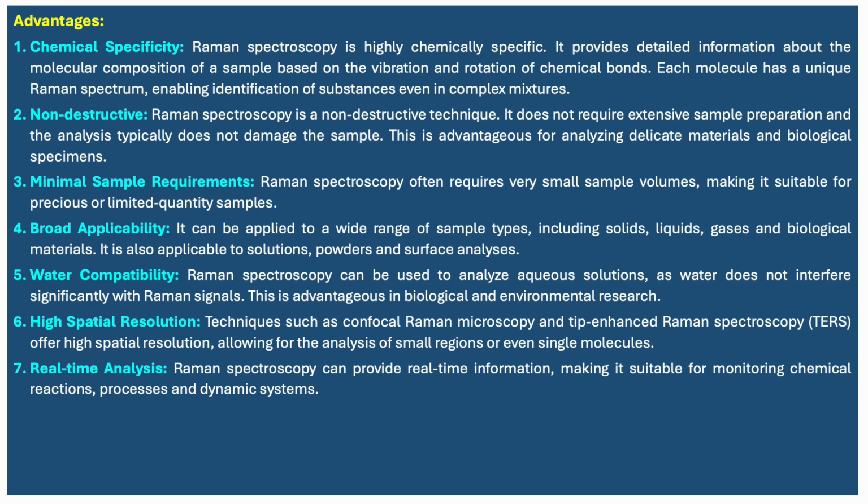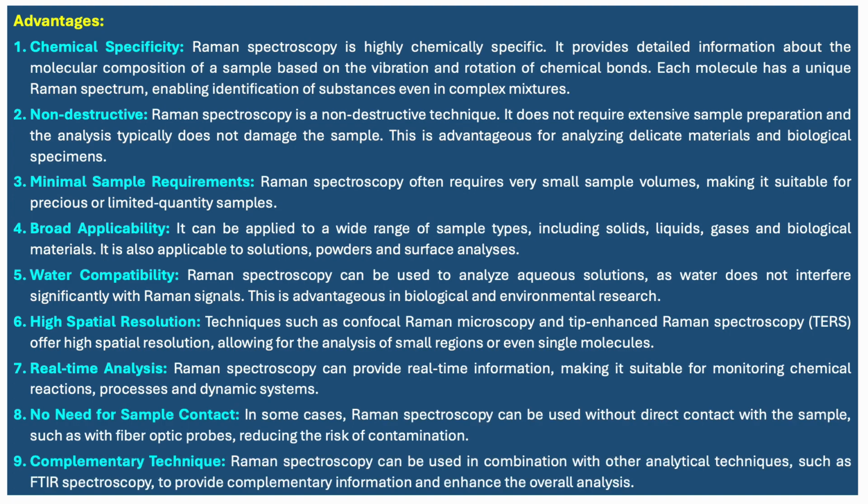Techniques such as confocal Raman spectroscopy and tip enhanced Raman spectroscopy offer high spatial resolution, allowing for the analysis of small regions or even single molecules. Raman spectroscopy can provide real-time information, making it suitable for monitoring chemical reactions, processes, and dynamic systems.